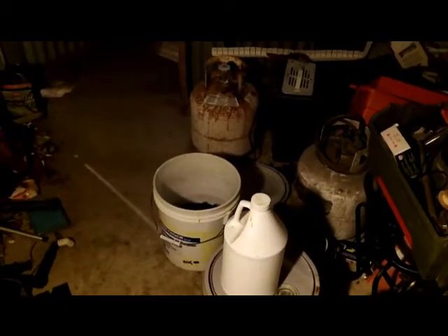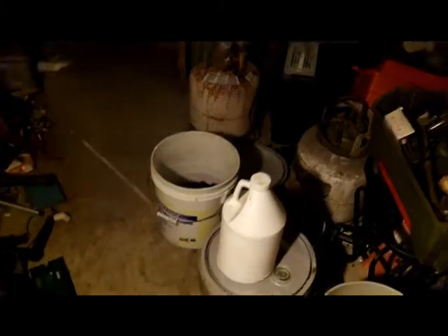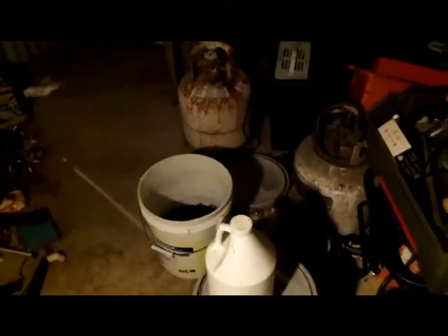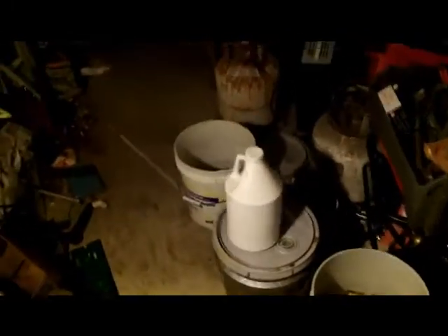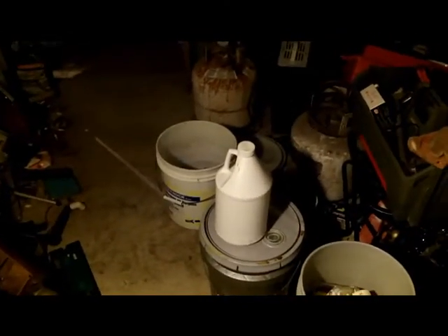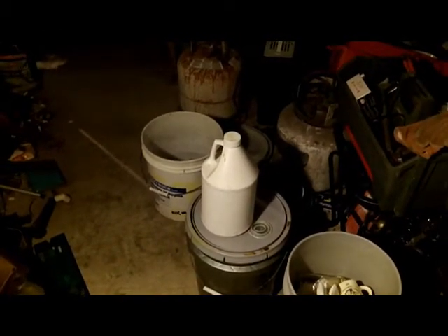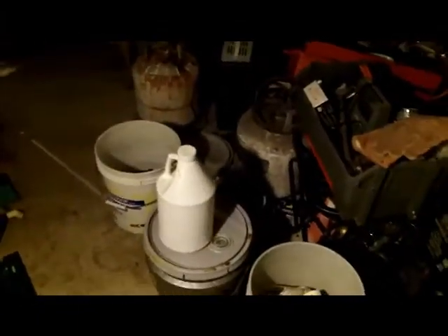I actually believe you could probably send it off to an assayer and figure out what exactly is in those crystals. I'm going to send off my crystals to have them analyzed and figure out what the best way is to dispose of it or market it after the fact. Right now I won't know what's going to be left over until we get to that point. The next step is going to be the evaporator unit, which I will show how to make and operate.